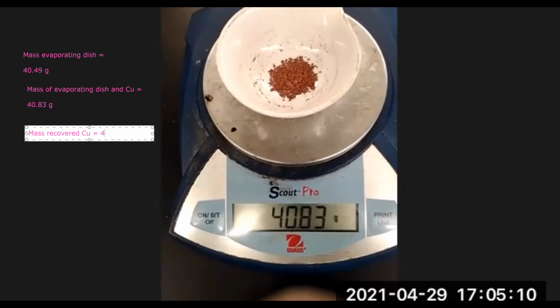It's just a difference between the two. .34 grams of copper was recovered. Remember, we initially started with 0.61 grams of copper.